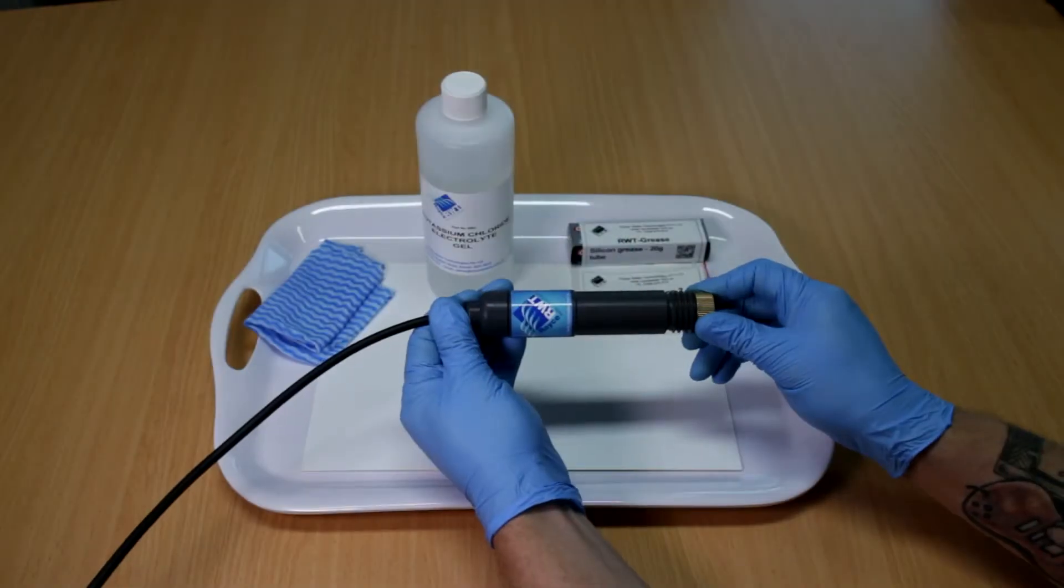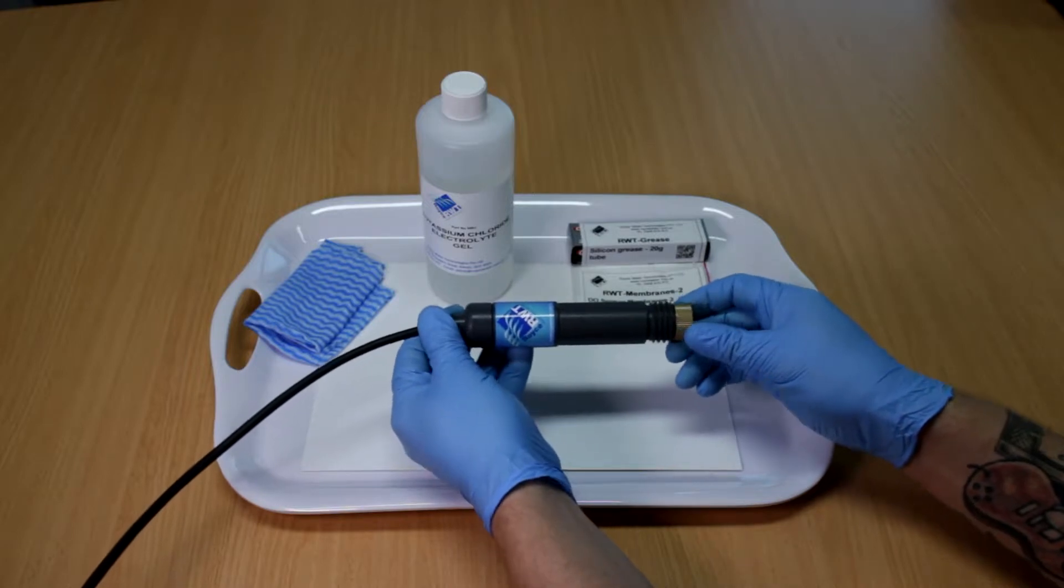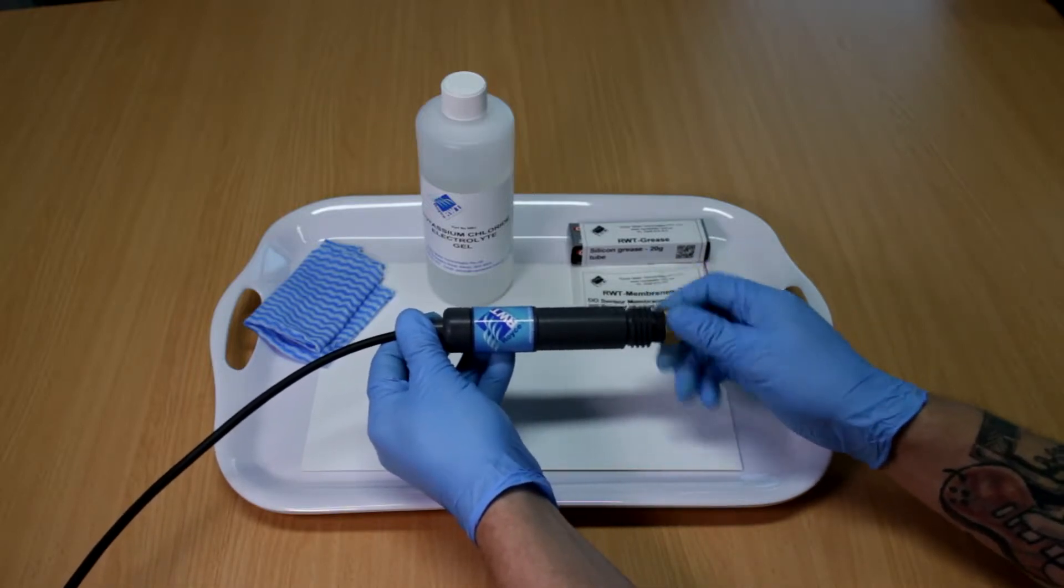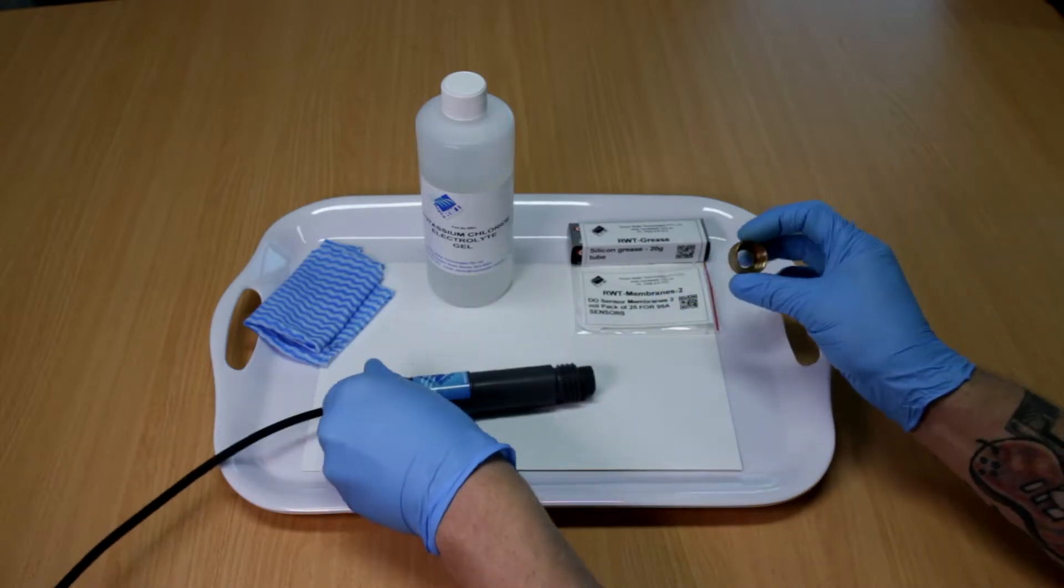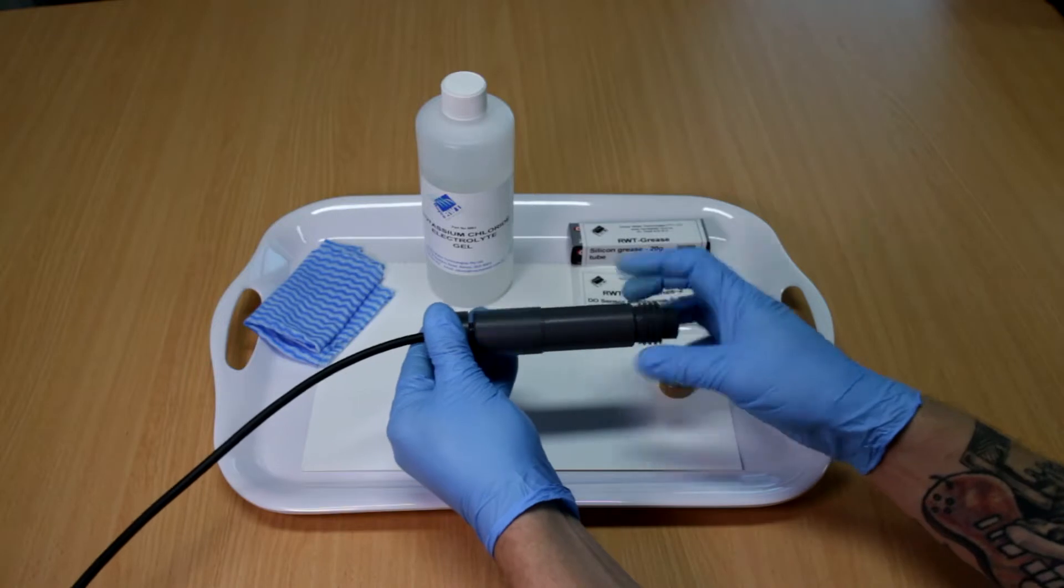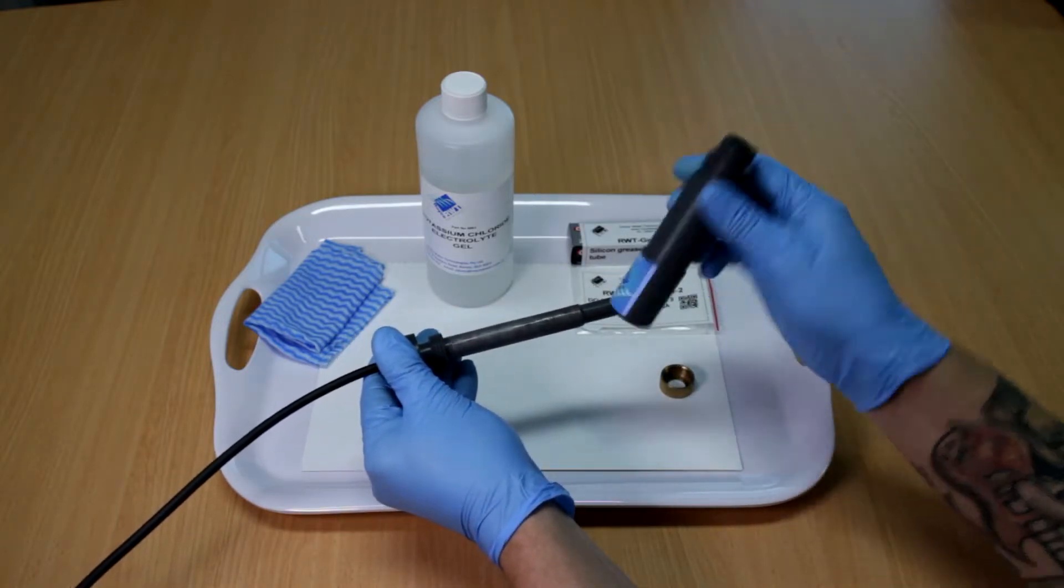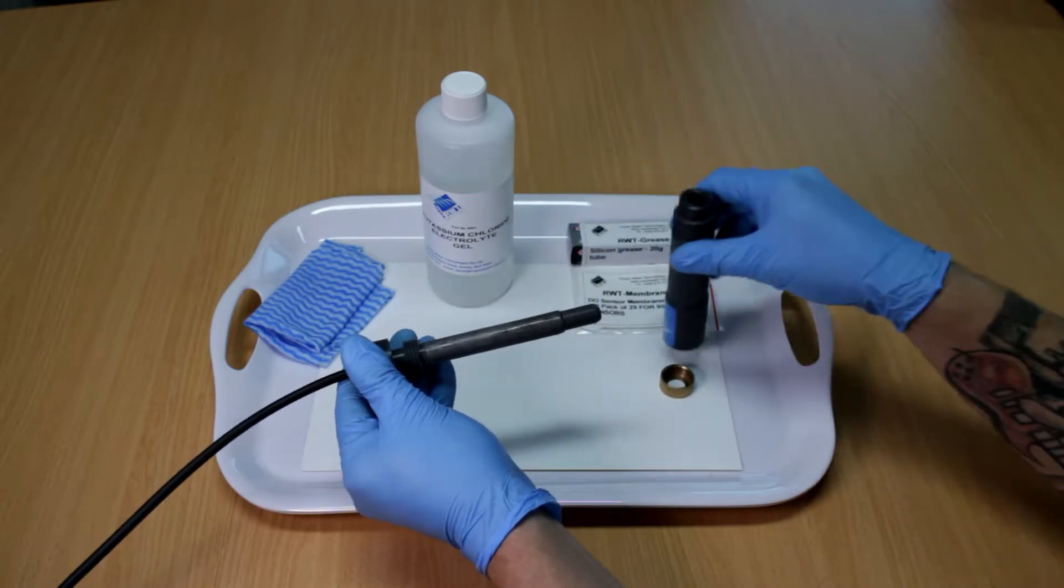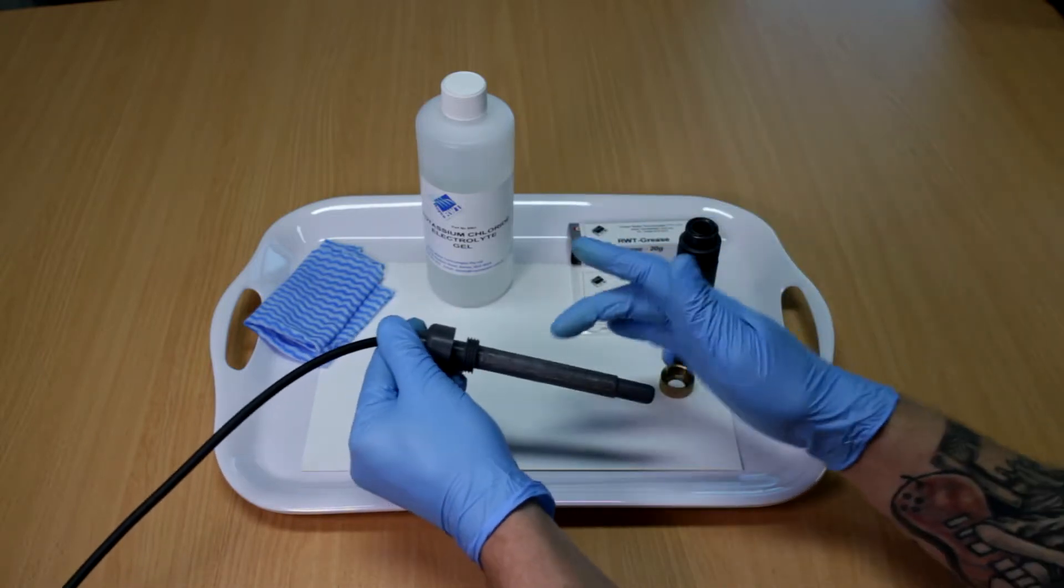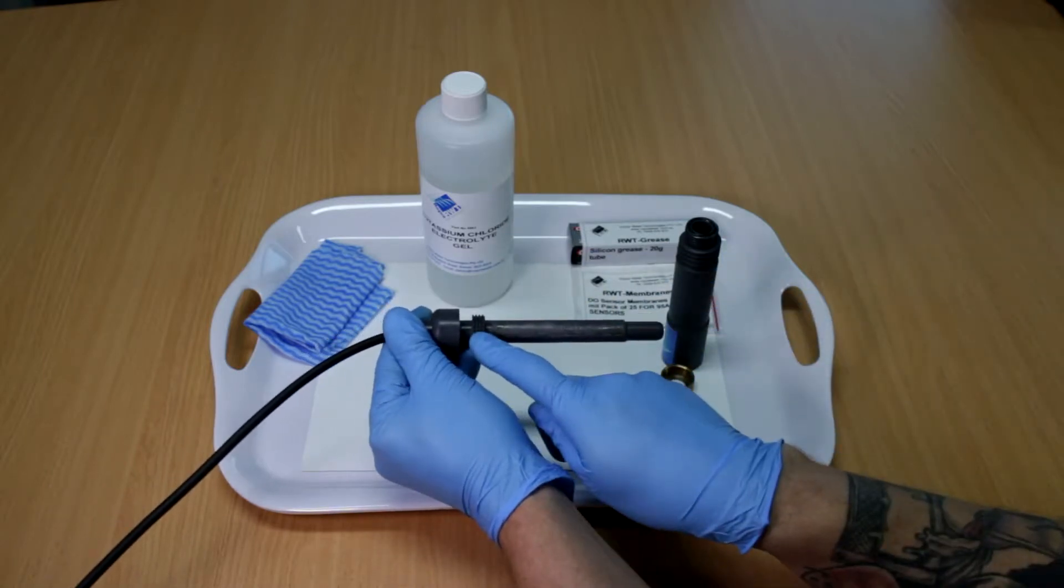This is the Royce water technologies G95A dissolved oxygen sensor as it comes out of the packet. We have a brass retainer cap for the membranes, we have a canister with O-rings on both ends, and this is the body of the probe: it's anode, a cathode, and a venting groove.